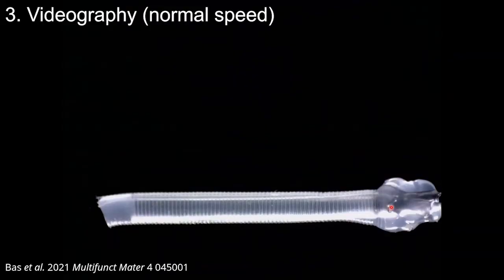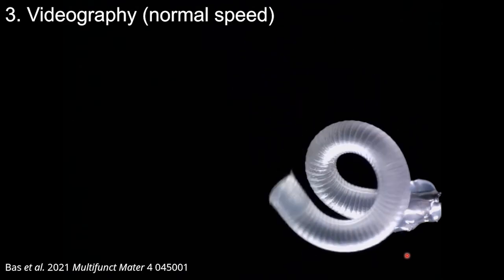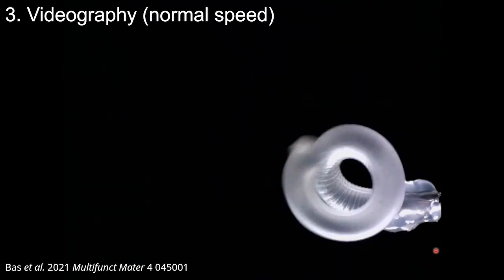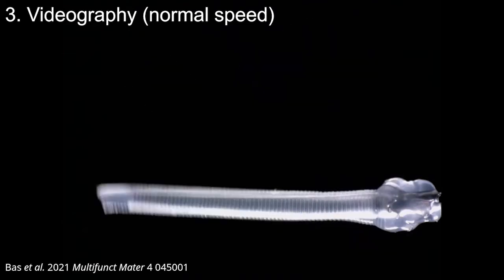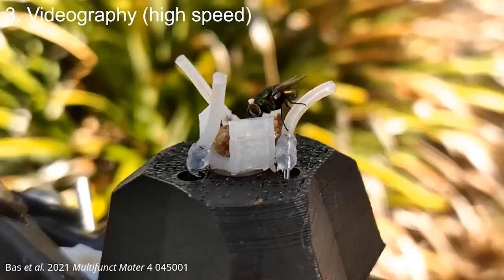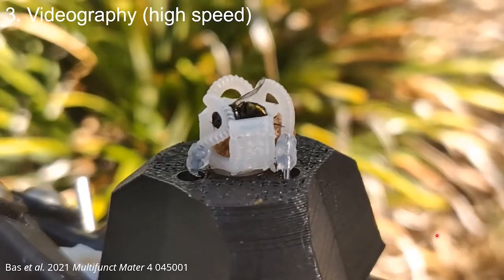Continuing with videography, here is a melt electrowritten tube where it is sealed with silicone and pressurized with air and blocked with a plug at the end. You can see that you have fibers going in an almost vertical direction, but there are two fibers going along the top. As you pressurize this, it will coil and then actually coil in the shape that's predetermined by the fiber placement. It actuates quite quickly. Moving forward with this kind of actuator to high-speed videography, a flycatcher was made where you have these actuators that can be pressurized to grab and hold a fly for a period of time until it's released.